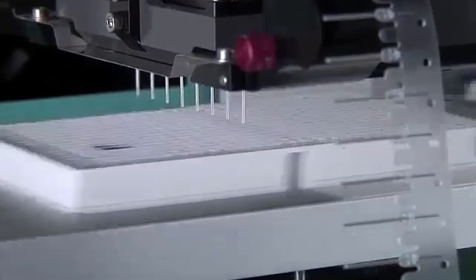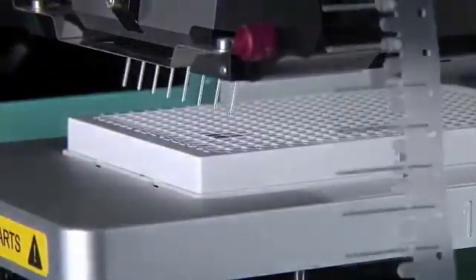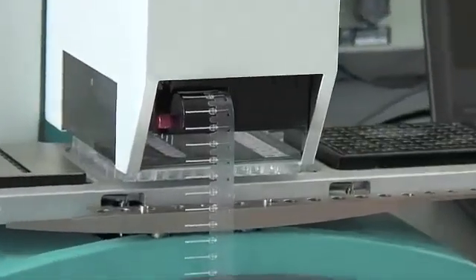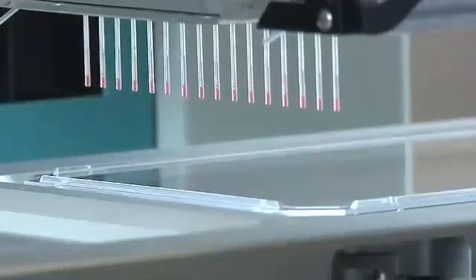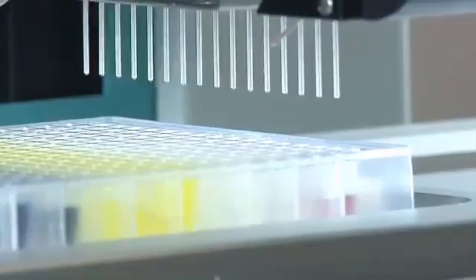Mosquito pipette tips can pierce directly through foil or plastic plate seals, meaning samples within the plate can be kept at their optimal condition prior to use. At the heart of the Mosquito system are its disposable positive displacement pipettes.